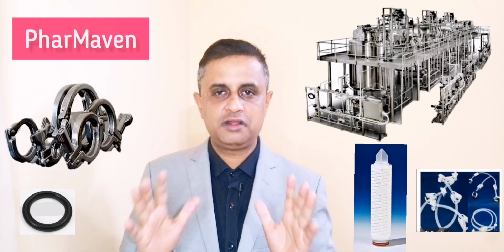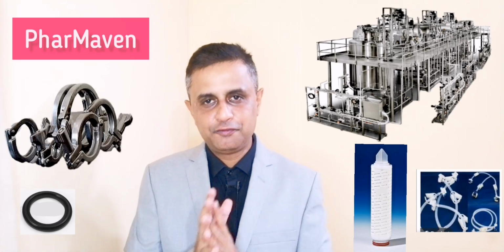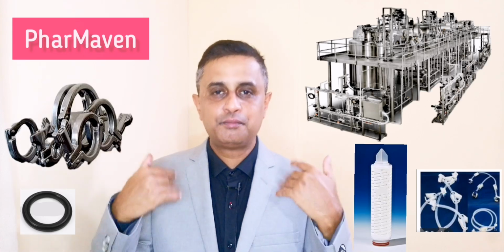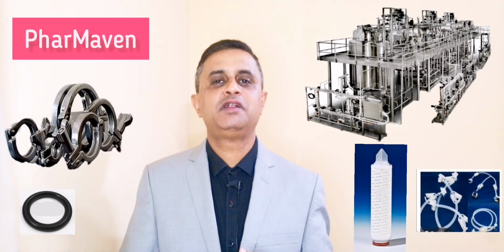Yes, of course, it will take some time. It can take a week to evaluate all these things, but it is better to spend a week on preparation rather than spending 2 months investigating your media fill failure.